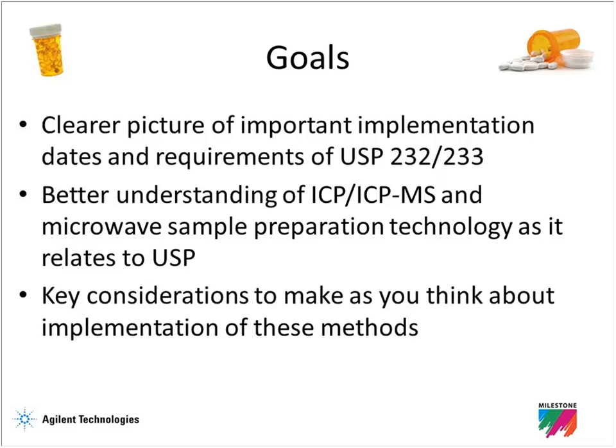And what we're really hoping to do for you all through these presentations is to, one, provide you a clear picture of the important implementation dates as they stand today and requirements of the new methods. We want to give you a better understanding of the analytical component of the methods, as well as the sample preparation technology that's available. And also, because one interesting thing about this is that metals analysis is new for a lot of labs in your industry.